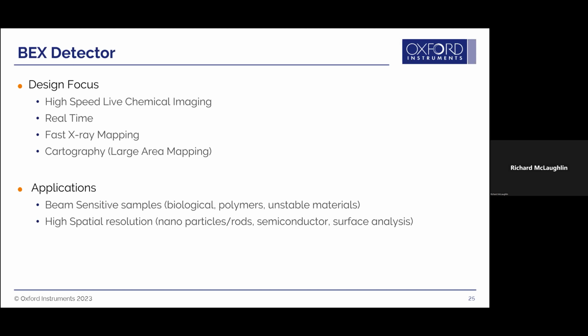Now the applications are beam sensitive samples. Oops, sorry, I made a mistake there in my slide. I copied the application there. So the applications will be large area mapping for one, and if you have very complex samples, like geological samples, as we've seen, and you want to do a survey.